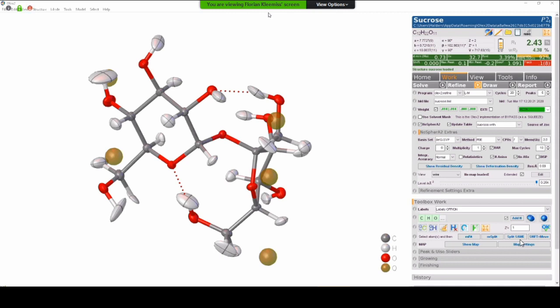What we do is we use the ADPs, the thermal motion, the positions, and use the non-spherical scattering factors, because the thermal motion is used in a convolution later on to convolute the static density that you also obtain from a spherical model, for example from the International Tables, and then get the full calculated structure factor that you use to refine your model in the same way, because the mathematics behind it is the same if you use the spherical or aspherical static electron density. Okay, good.